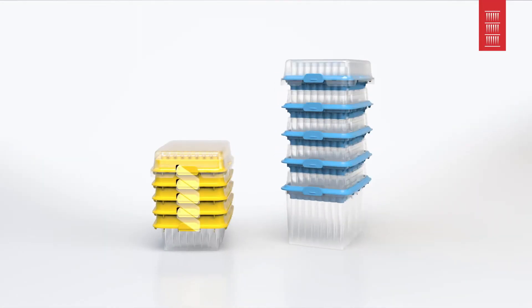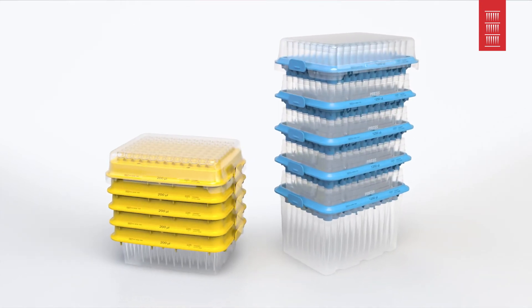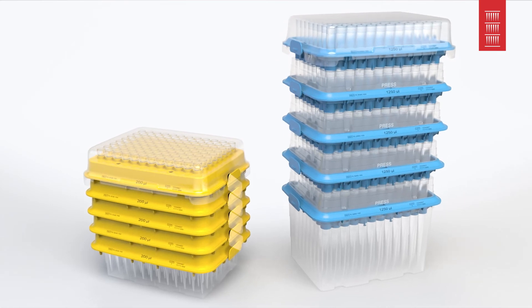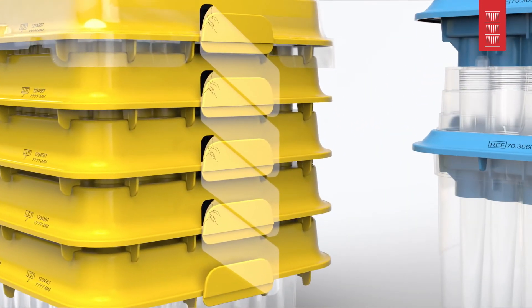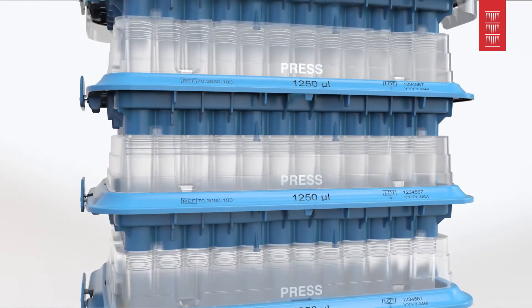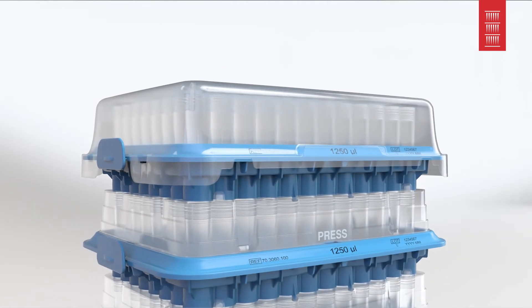Higher sample processing rates require more efficient solutions. The StackPak — the innovative solution for ultimate efficiency. Depending on the design, the spine of the StackPak is formed by the tabs on the side or the sturdy surrounding frame. This means your pipette tips are optimally protected and the individual tray layers are stabilized.